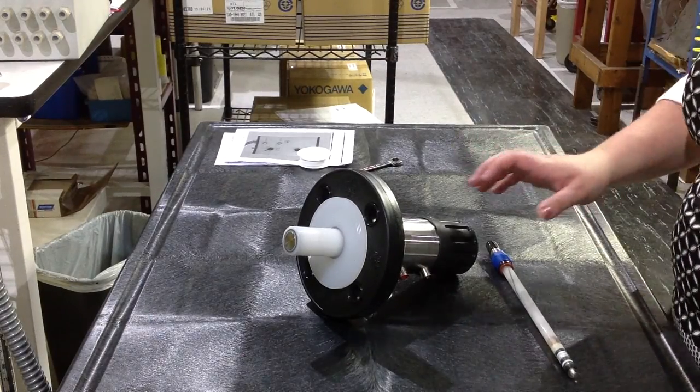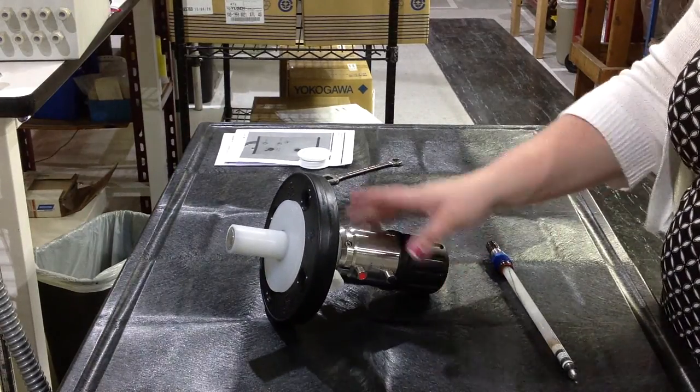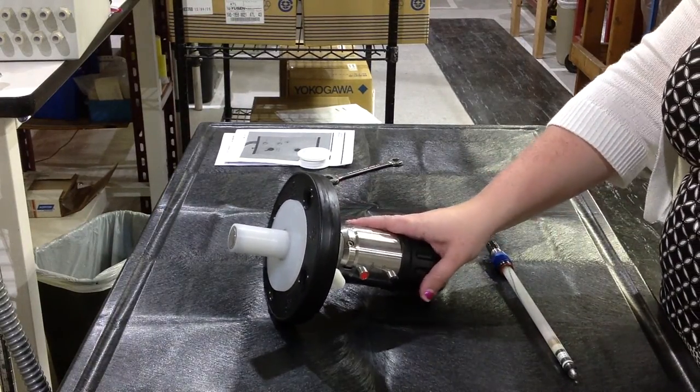I'm going to quickly show you how to use the manual online retractable that allows for online cleaning.